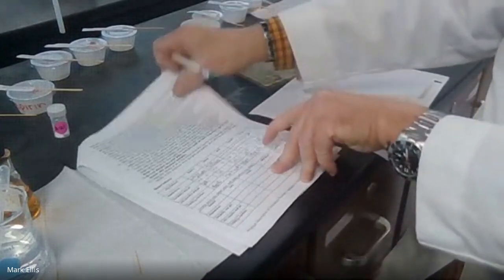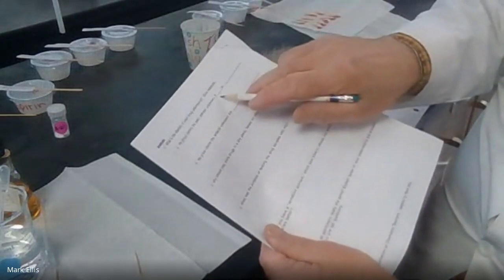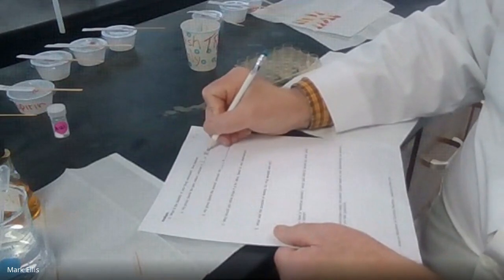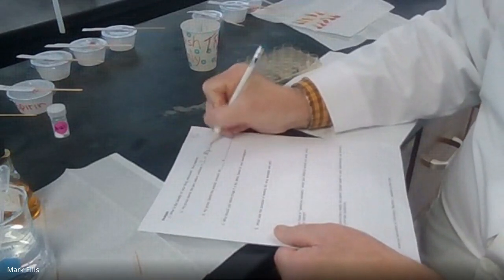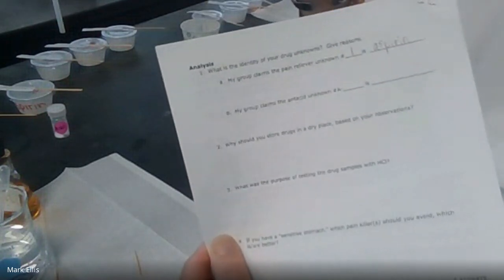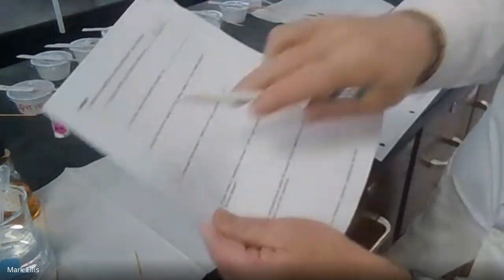So back here on the back page, I'm going to put my group claims that pain reliever unknown number 1 is aspirin. If you don't put what your unknown number was, the label, its ID, there's no way I can tell whether this is right or wrong. So you're just going to get it wrong. You have to put in your ID number. Then I'm going to do the same thing for the antacids.